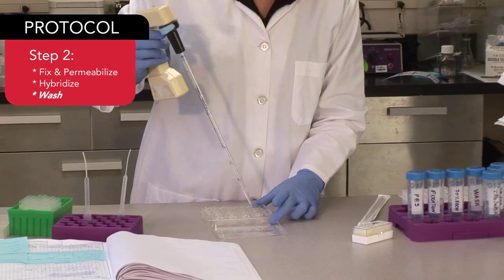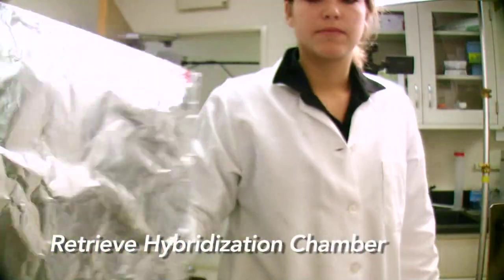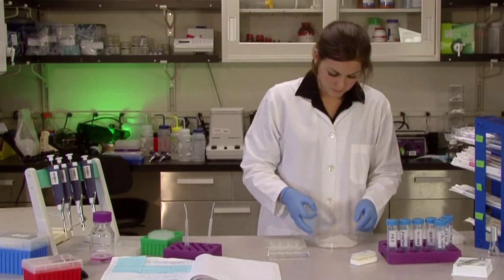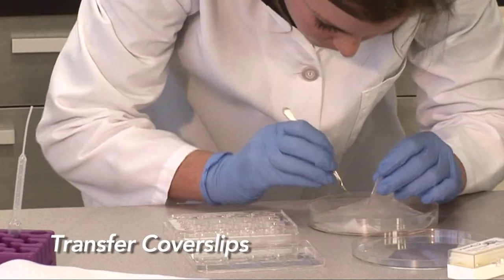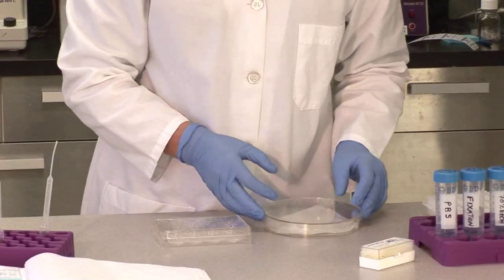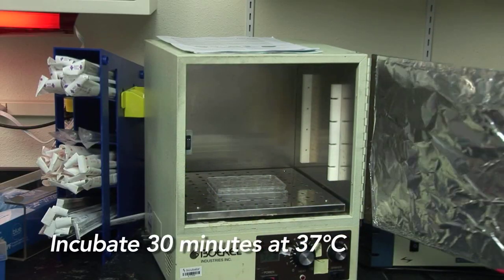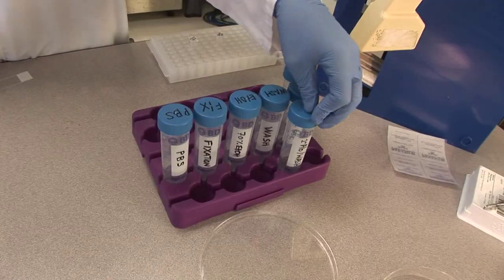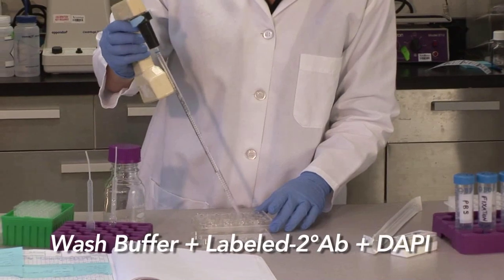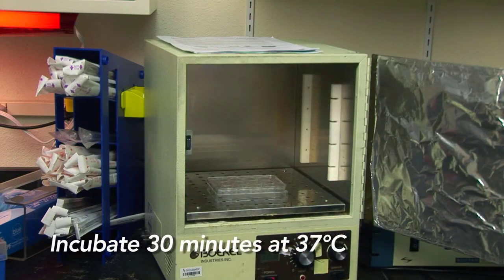The next day, before taking out your cells from the incubator, I'll add enough wash buffer with labeled secondary antibodies to the wells. Carefully transfer your cells face up into the wells of wash buffer containing labeled secondary antibody. The cells are now incubated for 30 minutes at 37 degrees. After the 30 minutes of wash, the wash buffer is aspirated. The cells are again incubated in wash buffer, plus labeled secondary antibody and DAPI. The cells are then incubated for 30 minutes at 37 degrees.